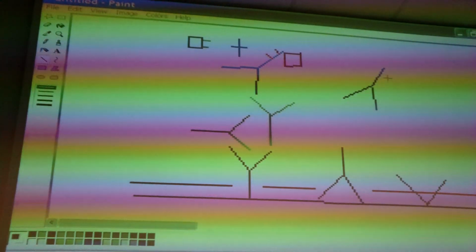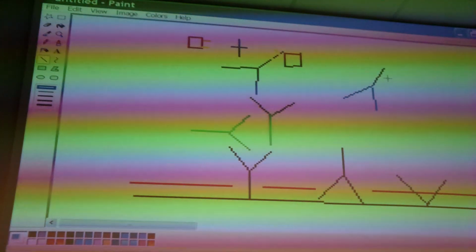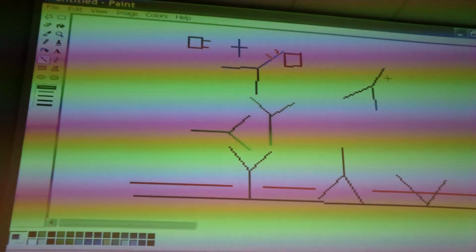So in some ELISAs you will find a big question mark. I'll explain. If the antibodies already bind serum, then what antibodies will bind to the specific antigen? Only the very specific ones, only the human specific antibodies, not the cross-reacting ones. So you would have to add a lot of goat serum in this case, which is a big source of unspecific antibodies.